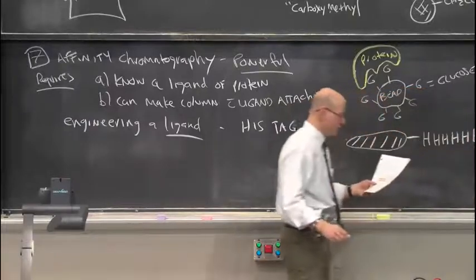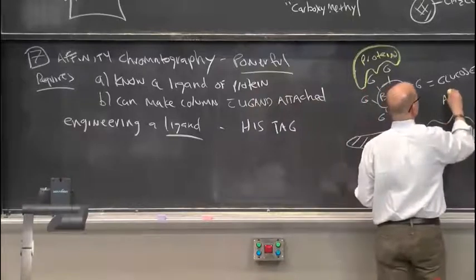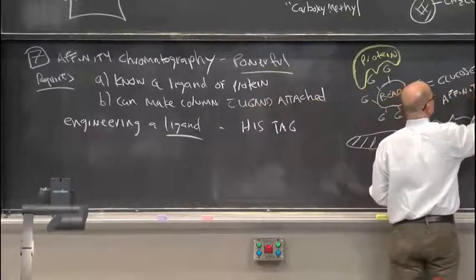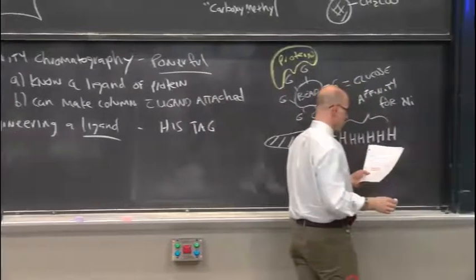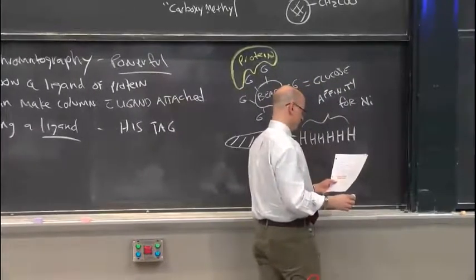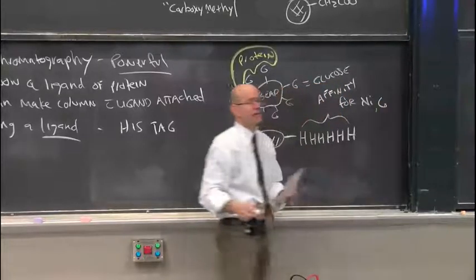It turns out that histidine has a very high affinity for certain metals, like nickel, cobalt. So I could make a nickel column.